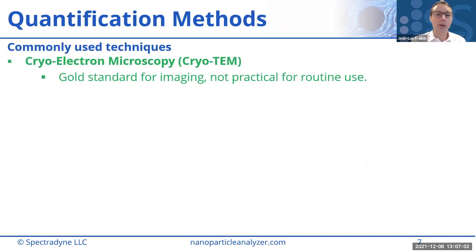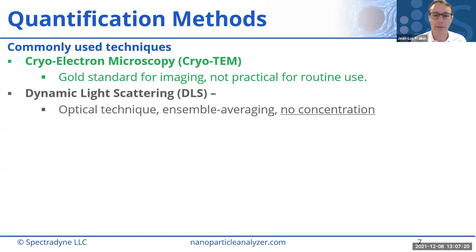So how are people currently doing this? There's cryo-EM, right? This is obviously a gold standard imaging technique. It's cool because you get to see what the particles actually are, and you can learn so much from that. It's also obviously not practical for routine use. There's not a lot of labs that can have their own cryo-EM system in-house.